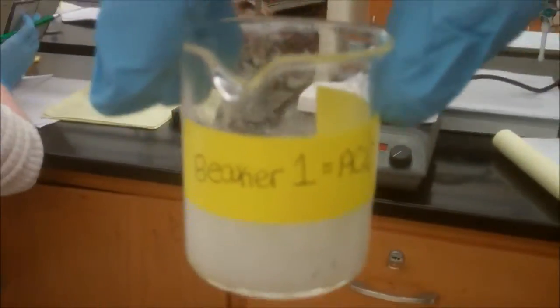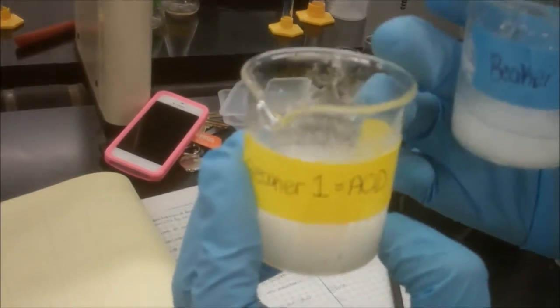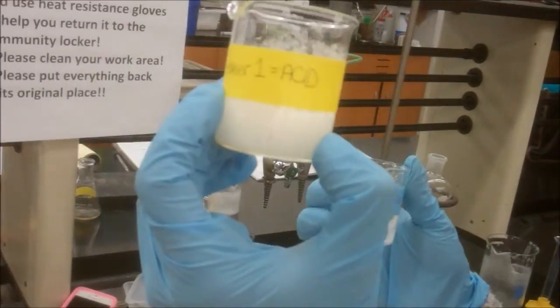This is the first extraction of the aqueous phase. This is our acid. You add the 6 molar hydrochloric acid into this one and you add the 10% sodium hydroxide into this one until the litmus paper turns blue for this and the litmus paper turns red for this.